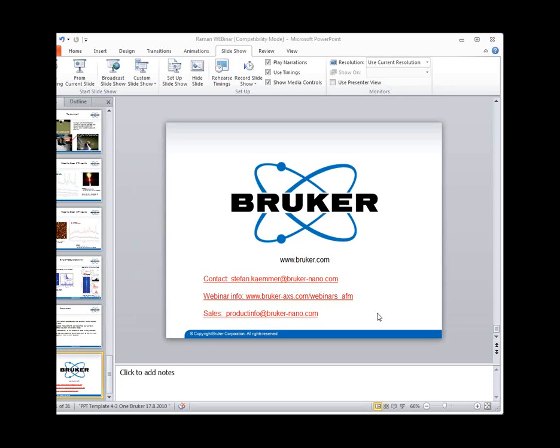You can either scan the tip or you can scan the sample. In the Icon instrument, you scan the tip. That basically means you can use a sample of almost any size. In the Innova AFM and in our Multimode, we scan the sample. That restricts you in terms of the sample size. So it's a different thing.